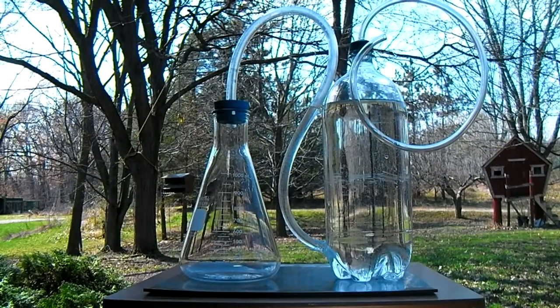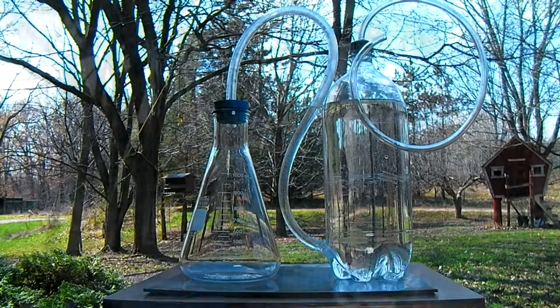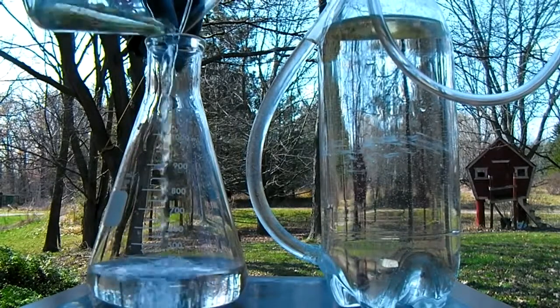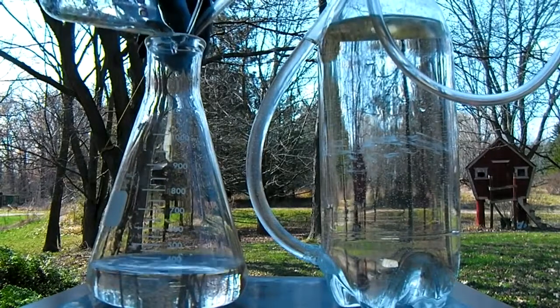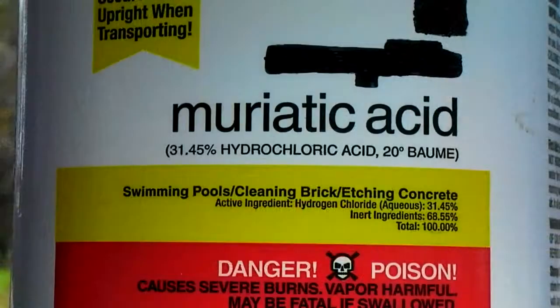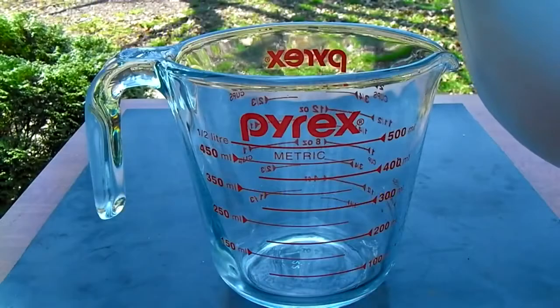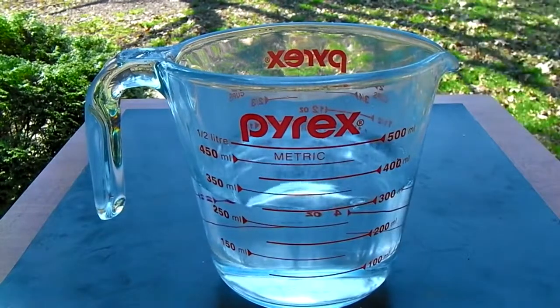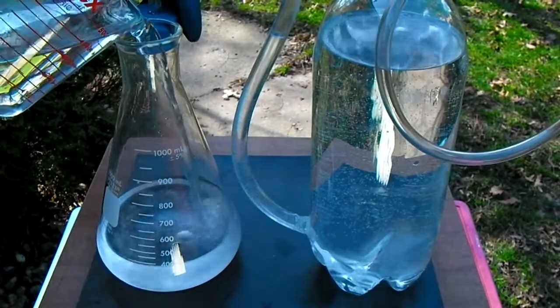First moving outdoors to begin this reaction, we will start by filling the 2 liter bottle 3 quarters of the way full with cold water. Another 300 milliliters of water is added to the bottom of the flask. Muriatic acid is the common name for hydrochloric acid which will be the primary reactant in this process. This sort of acid can be purchased at almost any hardware store for only about $5 a gallon. 300 milliliters of muriatic acid is carefully measured and then slowly poured into the flask to mix with the water previously added.